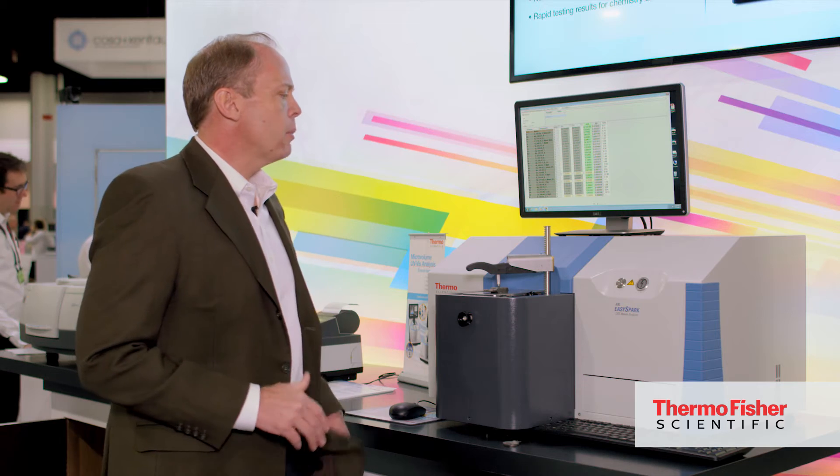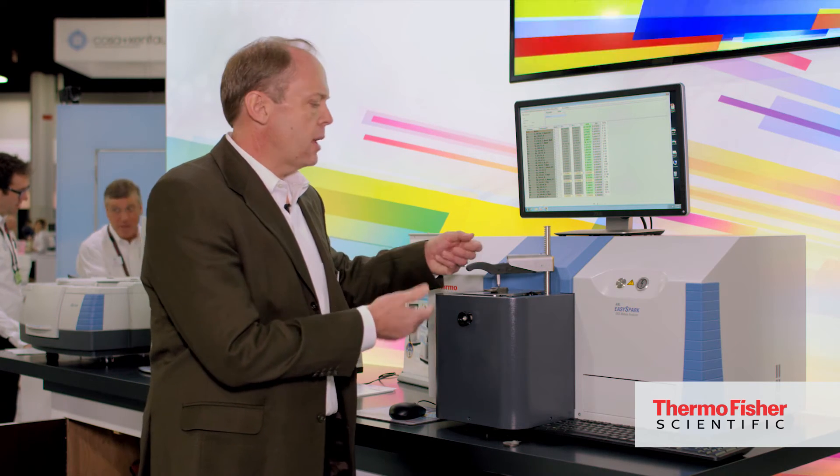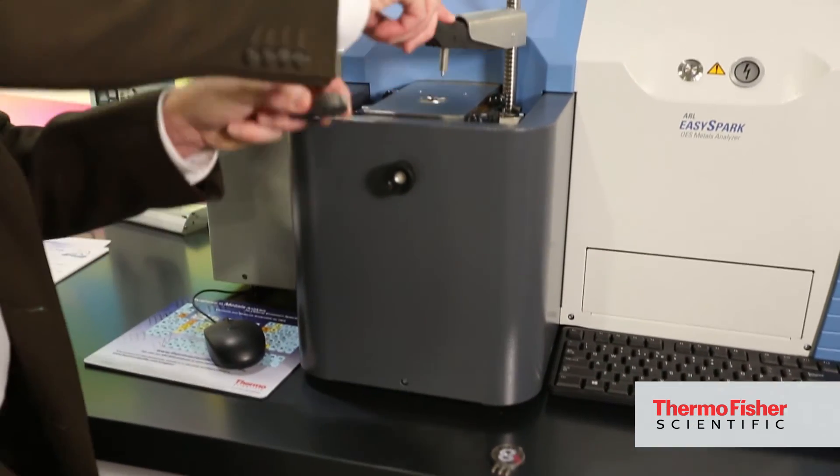The software has been simplified for easy use for multiple operators with minimal training. We have an open spark stand to allow us to analyze various sample sizes and configurations.